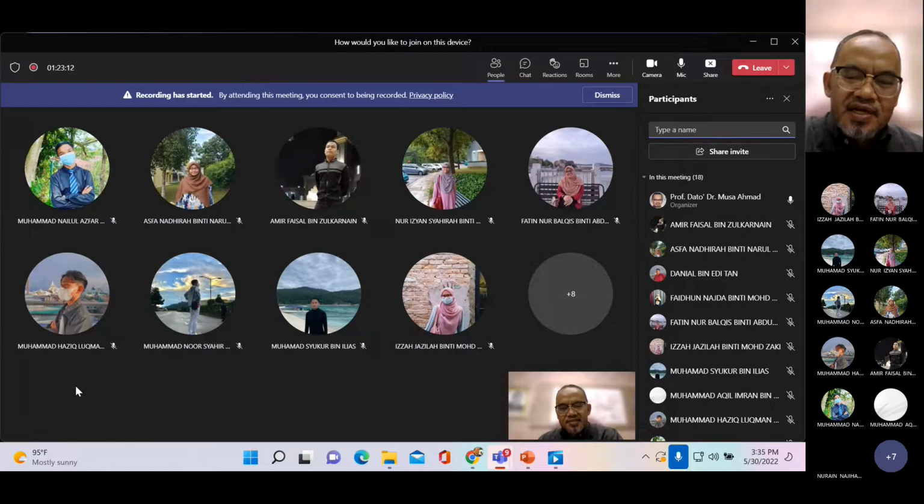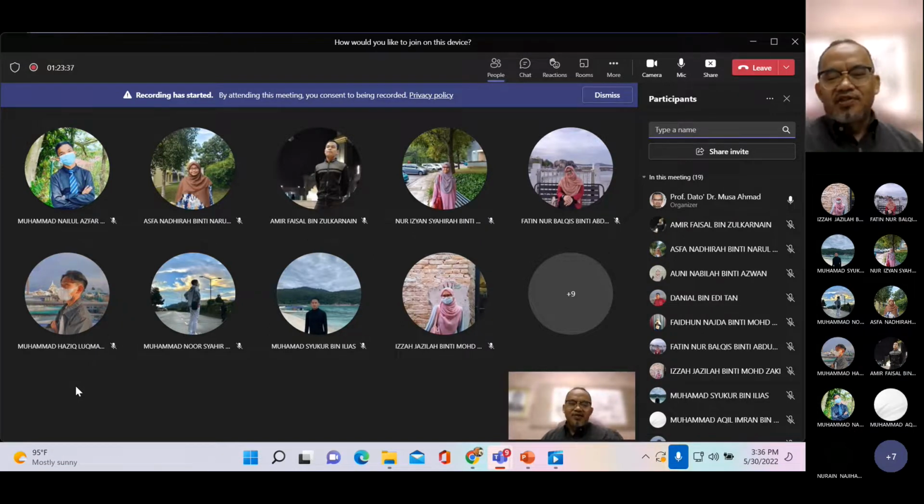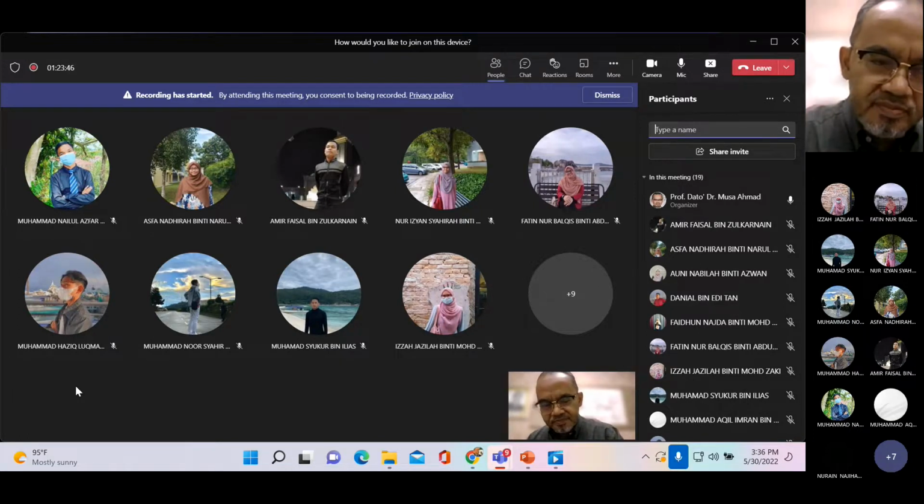Jadi isunya adalah tidak semua molekul boleh menyerap julat UV dan juga visible. Kalau semua molekul boleh menyerap, so tak spesifik lah molekul tu kan. Maknanya semua sama je sifat-sifat dia. Sebab semua dia boleh serap. Kalau semua molekul boleh serap, jadi kaedah tu jadi tidak selektif. Dia boleh detect banyak molekul. Jadi kita nak kan kalau boleh, bila kita buat dia untuk detection ni, they should be specific.